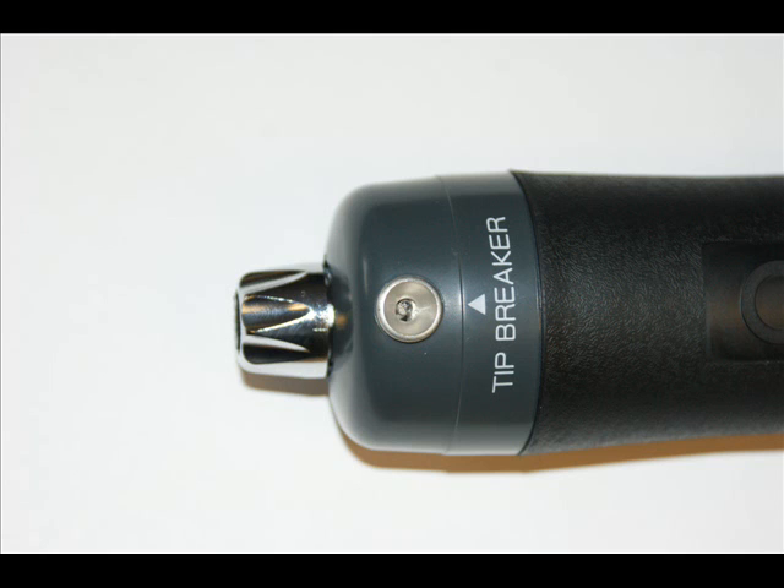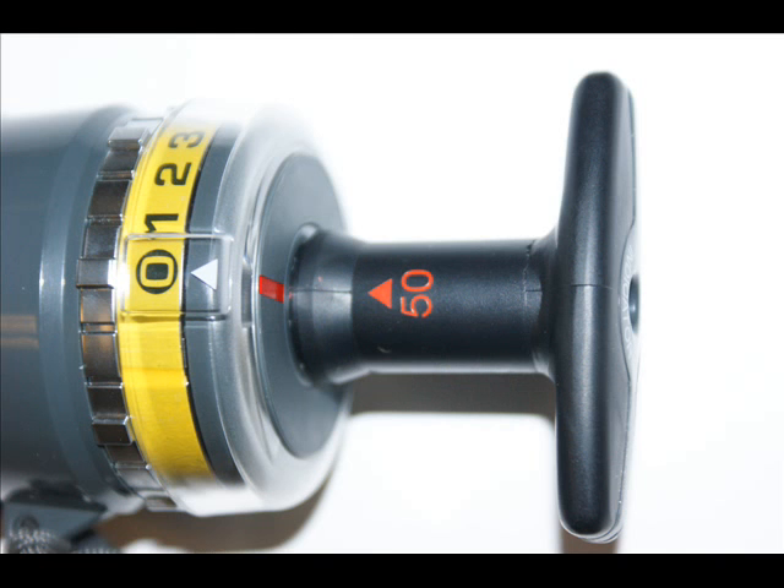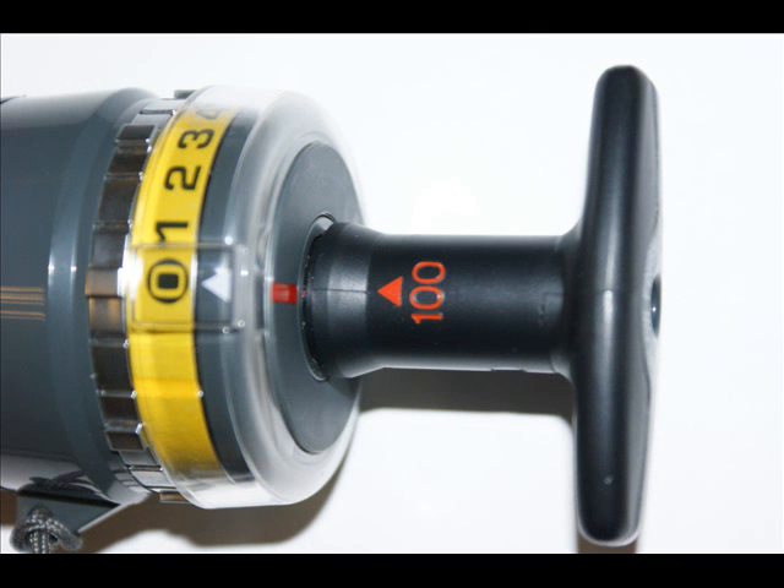Features include the tip breaker for convenient cutting of the tubes. The stroke counter, particularly useful for when detecting low levels of gas where maybe 5 or 10 strokes are required. The pump is calibrated to pull both half strokes of 50ml and one whole stroke of 100ml.